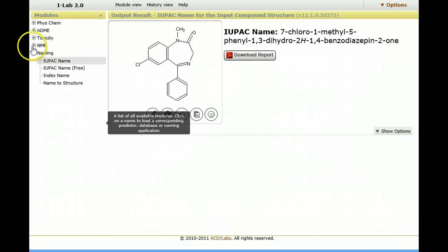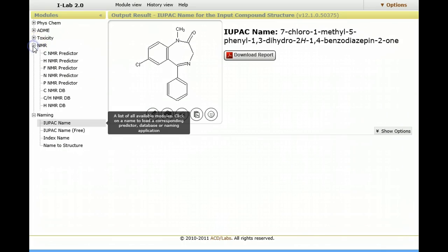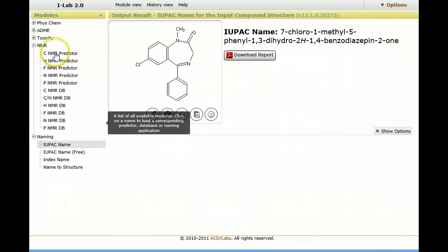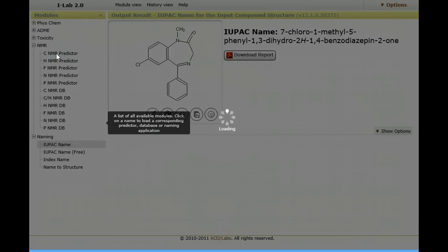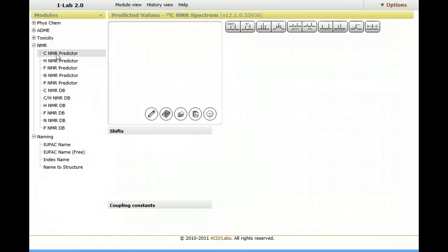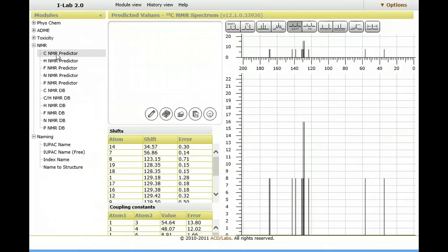However, next I may be interested in predicting an NMR spectrum. So in this case, I open the NMR modules, I calculate the carbon NMR spectrum, using algorithms that have been reported in a number of peer-reviewed publications. It's a well-proven software platform.